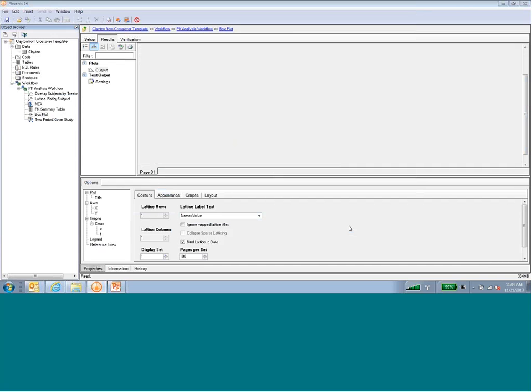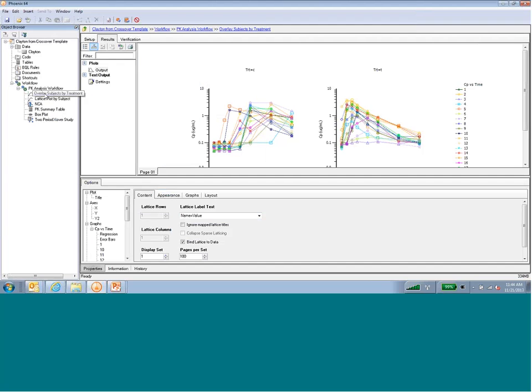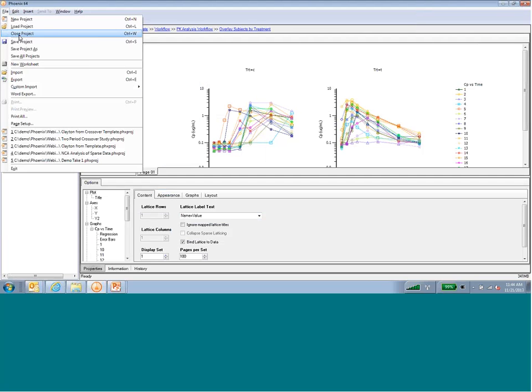And with a few minutes remaining, I think what I'll do next is cover a special case that applies usually to toxicokinetic studies. You've seen that most of the data here has been very rich in terms of the number of samples collected.